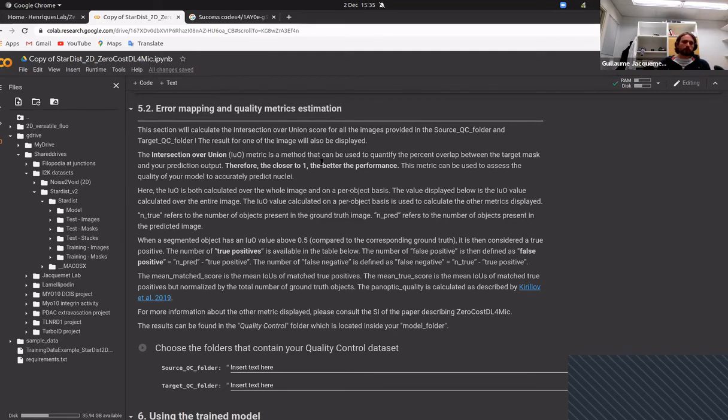To really ensure that you validate on something as far away as possible from the training step, so that you know you're not biasing yourself. There's no bias in any way. Because some deep learning networks can still use some of the results from the validation data during the training to tune themselves. And so there you're completely excluding those options.